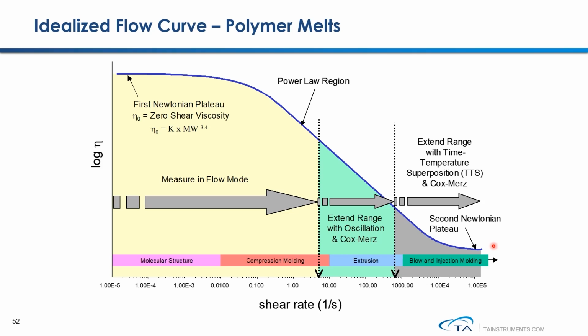molding. However, since polymer melt is viscoelastic, conducting flow measurements to measure the viscosity over a wide shear rate range is very challenging. Edge fracture is typically observed at shear rates no greater than just a few reciprocal seconds. This means you will not be able to perform flow measurements to measure polymer melt's viscosity, especially up to higher shear rate conditions.